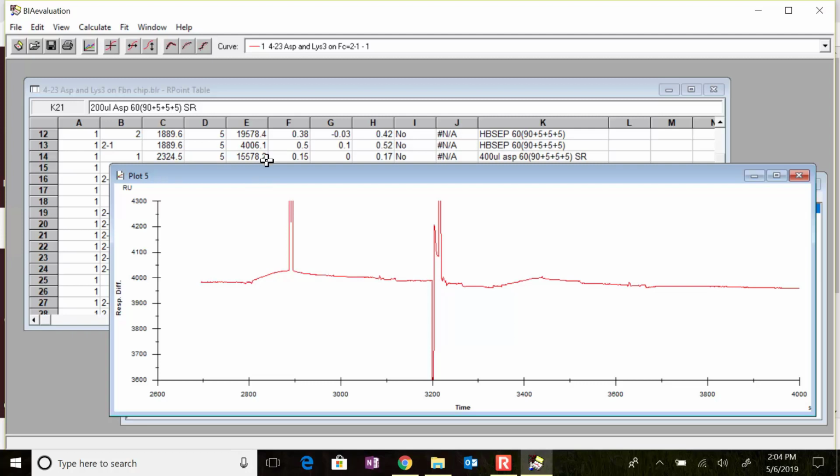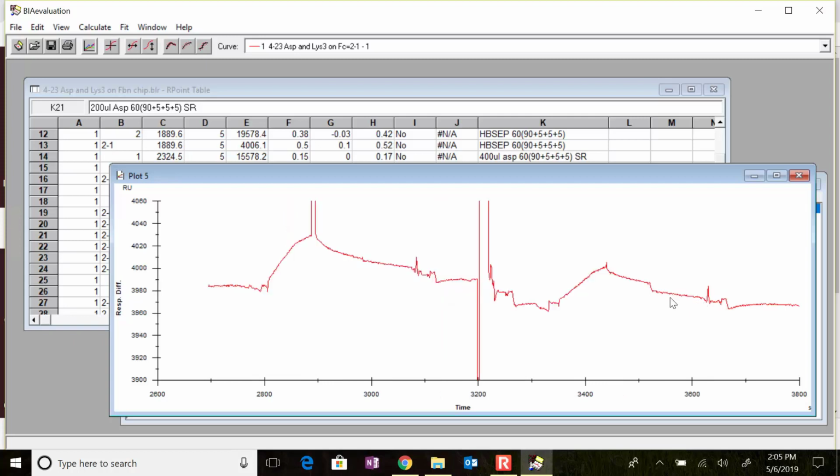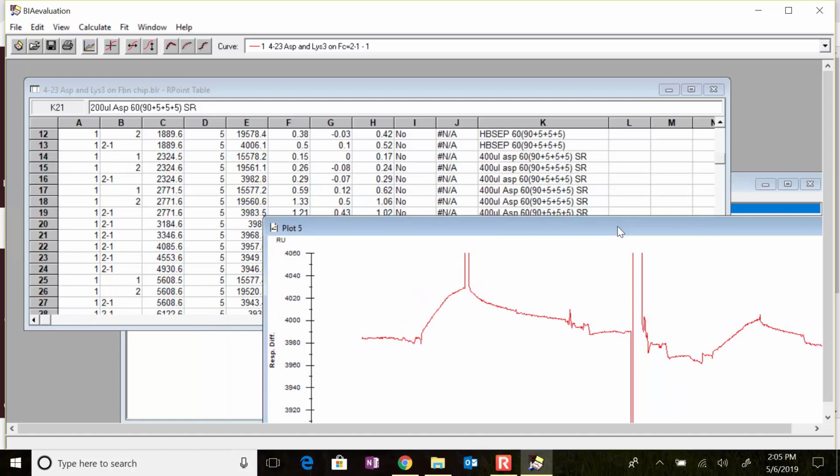Oh, did it not save one? Sometimes you look through and you see that it didn't save one, because you see we still have something at 2800 there. Oh, I missed it because we had 2 in a row that were both 400ths. Okay, so you can see that here's our second 400 right here. I just skipped by it because I didn't notice that the time was changing, 2771. So, well, that's real easy to get.